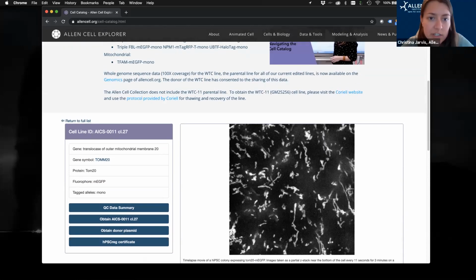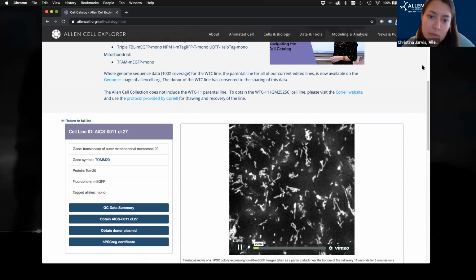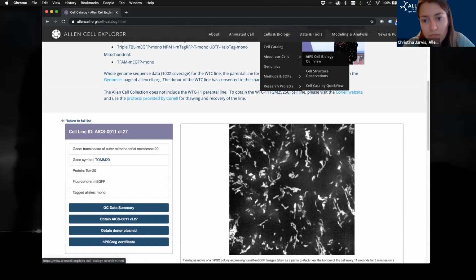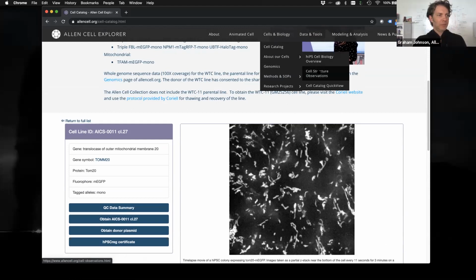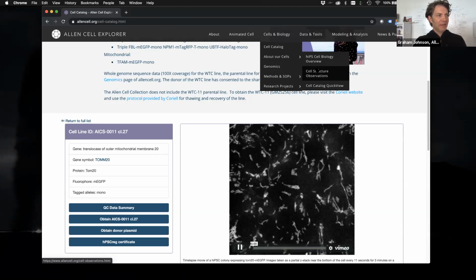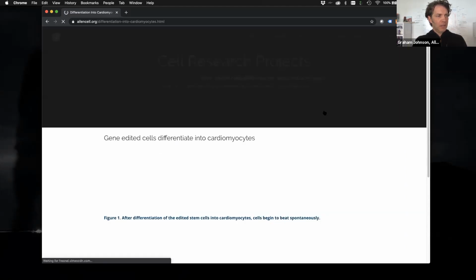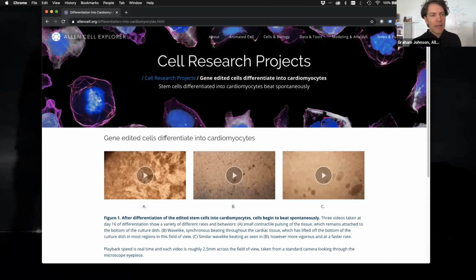W. Cesario is also asking, do you have images with these cells differentiated that students can see the molecular differences between stem cells and differentiated cells? So the short answer is both yes, but it's not very satisfying yet. There is differentiation in the cardiomyocytes. We're really working on this just now, meaning that it's very difficult to figure out how to capture these in the microscope, especially when they're beating. And you want a three-dimensional version because you have to capture one slice at a time while the thing is moving so rapidly.